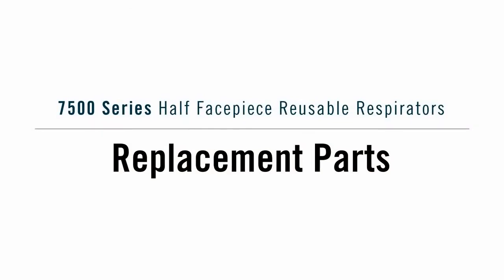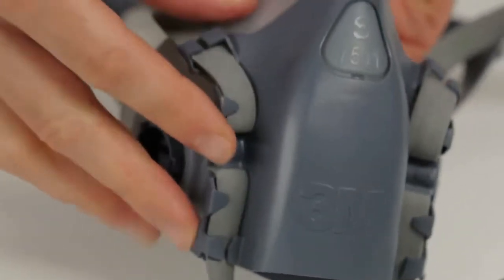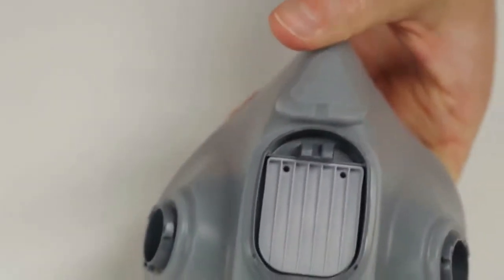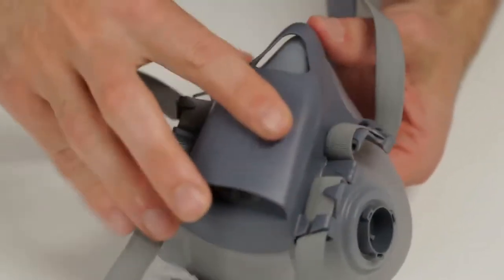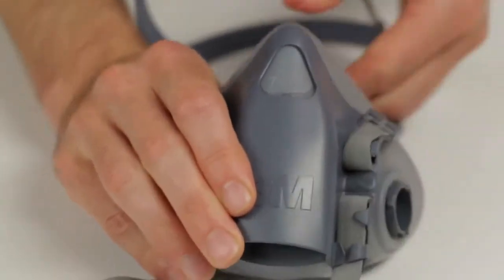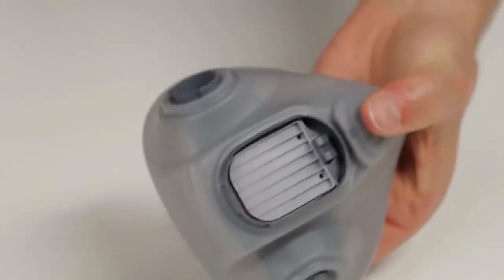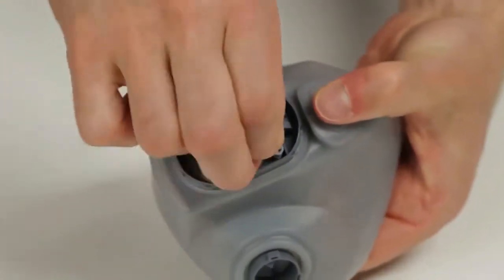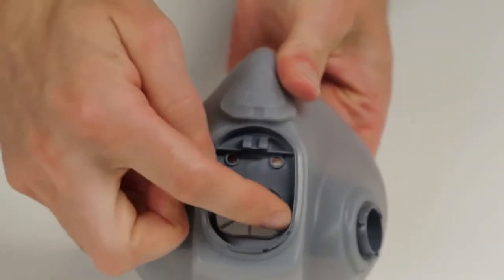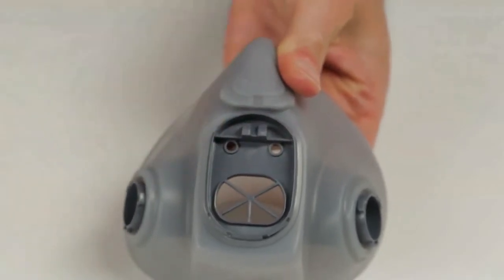7500 Replacement Parts. To remove the head harness assembly, pull it away from the face seal by grasping the edges and pushing on the silicone triangle with your thumb. To replace the head harness assembly, align the parts and push them together firmly until 2 clicks are heard. To remove an existing exhalation valve, remove the head harness assembly as you did before. Remove the exhalation valve by grasping the valve and pulling each valve stem out from the valve seat. Inspect the valve seat to make certain it is clean and in good condition.